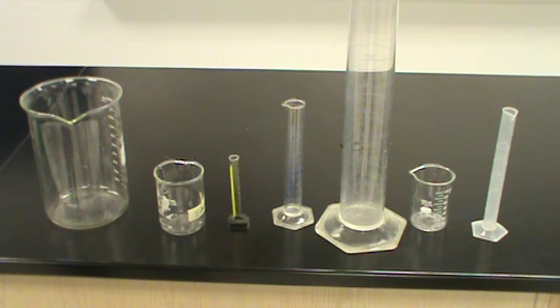We're going to stay away from that one today but we are going to do the next practicum which has to do with liquid measure. But first let's just look at some of these things that are in front of us that we have right here. All of these are devices for measuring liquid.